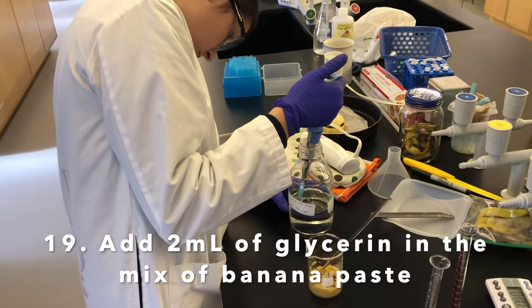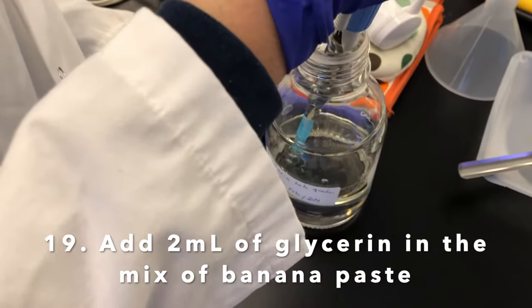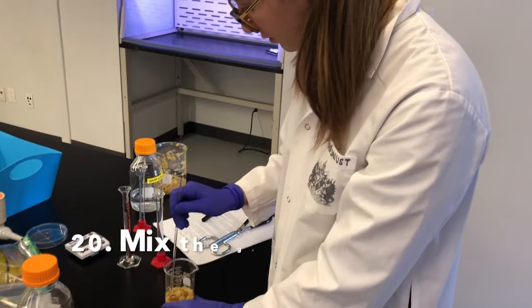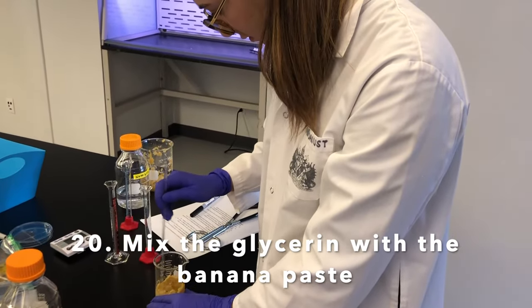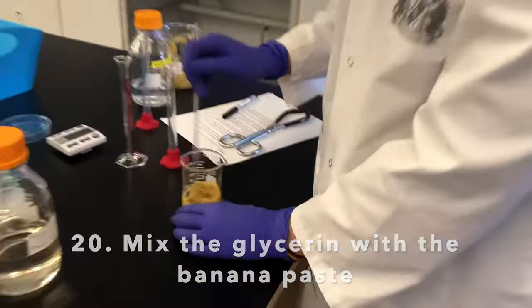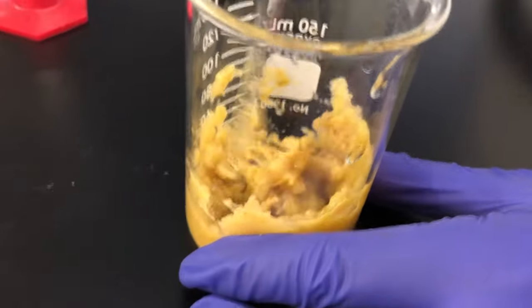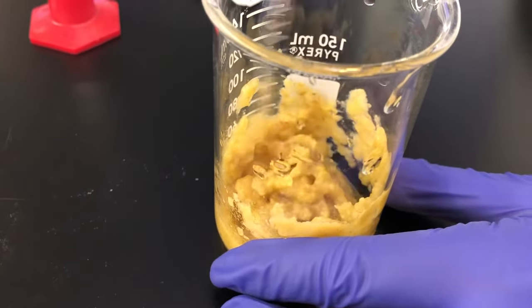The glycerine is acting as a plasticizer. Emily is going to take a micropipette and add 2 times 1 ml of glycerine into the banana paste solution. Marion is then mixing the glycerine with the banana paste mixture. The glycerine helps with the resistance of the plastic.